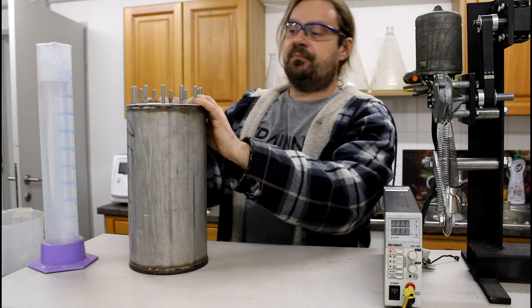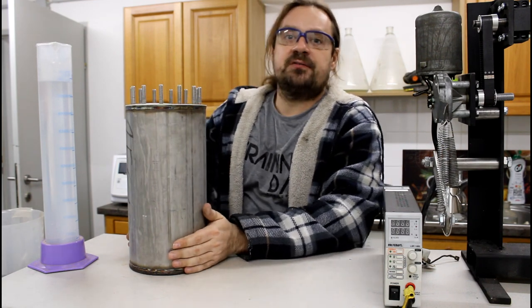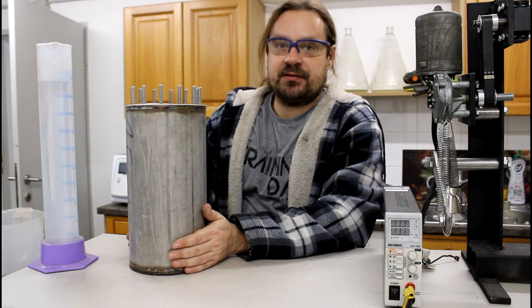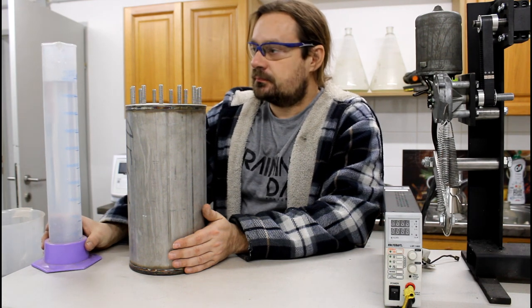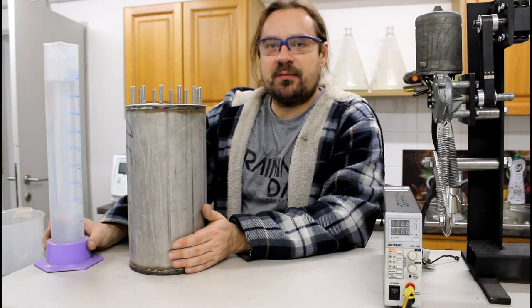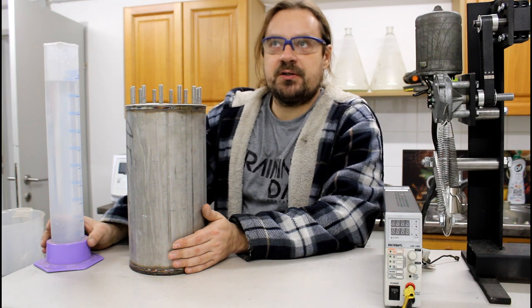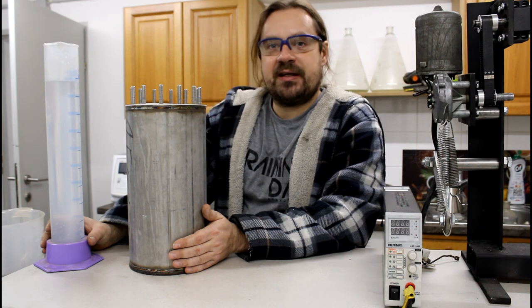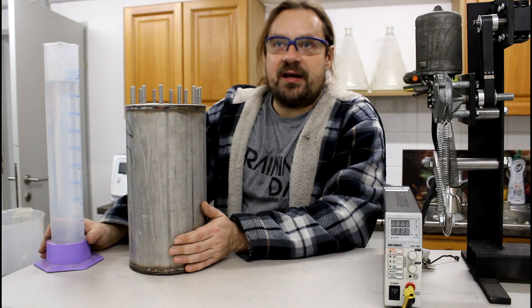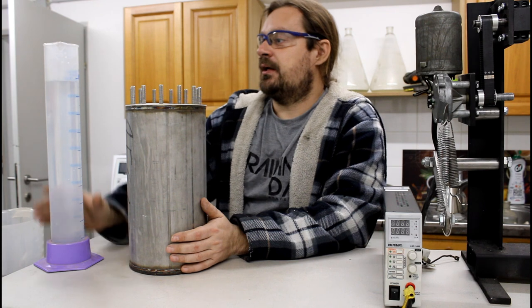Okay, so now the mineral and the lye is inside the reaction chamber. As I have told, it's about 800 grams of mineral and 800 grams of lye. So usually I use a little bit more water than lye. In that case, when I have 800 grams of lye, I use about 1 liter of water. So we are not making a 50-50 percent lye water solution. We are making about a 45-55 solution, something like that, you know.